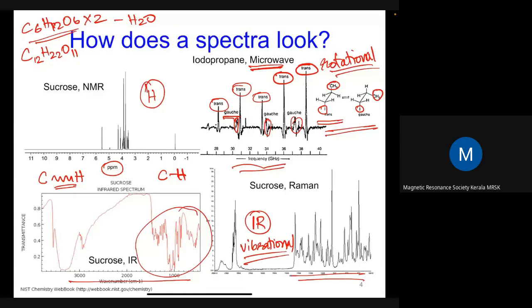In this example that I've taken, although 22 different protons are present, if you expand and see this spectrum, you would be able to realize that you can actually assign every proton in this molecule to a certain signature that is being present. This is important largely because when you're trying to characterize the molecule, you'd like to know which atom behaves in which way. You might have different CH protons that are present, and if you are able to distinguish these different CH protons using a spectrum, then you have the power of trying to say, when you make a change in this molecule, how does the molecule change, or whether the molecule changes at all. So this is where the power of NMR is, where you get atomic resolution information.